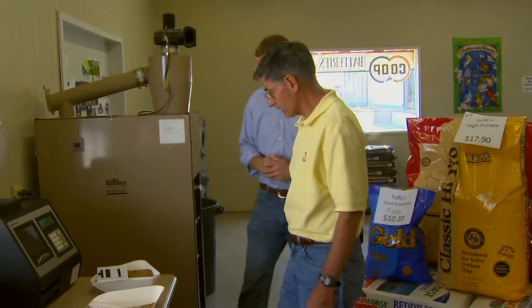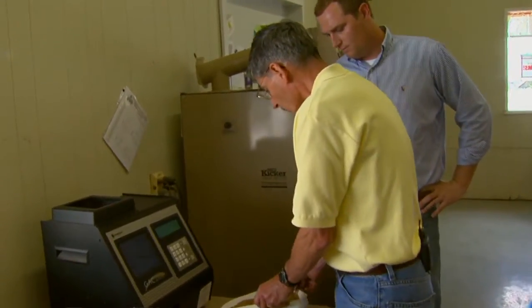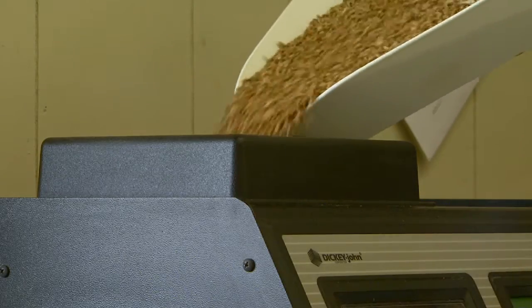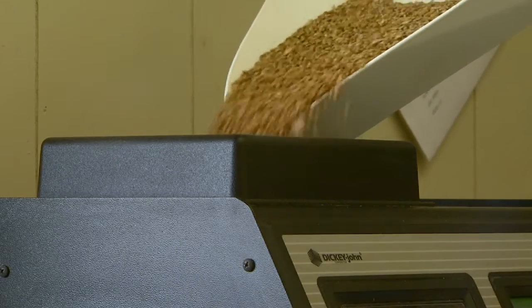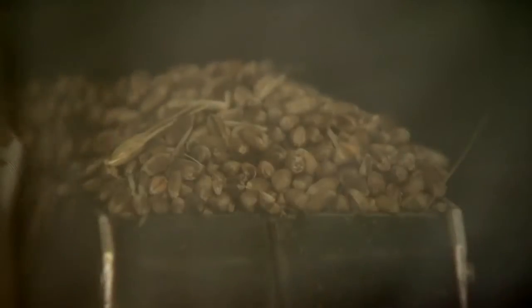So the next step is to go ahead and run a sample. We got a sample from a truck here that was fixing to grade. What comes off the truck — you want to get the moisture on that first. That's the most important thing. You're going to do that before they even decide if they're going to take it. You've got to have the moisture on what goes in the bin.